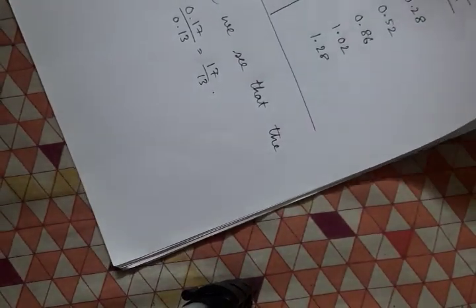So here the height is 0.34 and the width is 0.26. So here it is, and then after, wait a sec please.